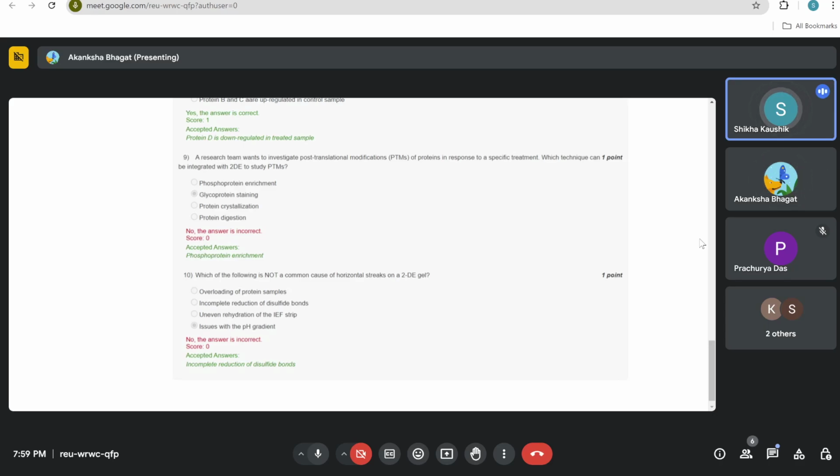Because 2D में separation कर भी सकते हैं, क्योंकि resolution तो उसमें भी हो रहा है, but yes ma'am, I have my doubt कि वो native conditions में करते हैं या reducing gel में करते हैं. I have my doubts on that. So when it comes to post translation study, just first go with the phosphorylation studies.